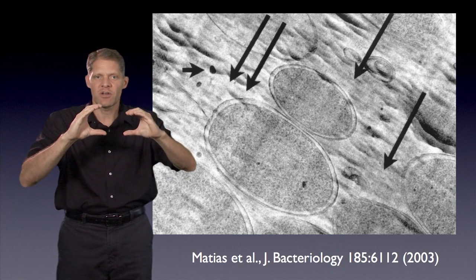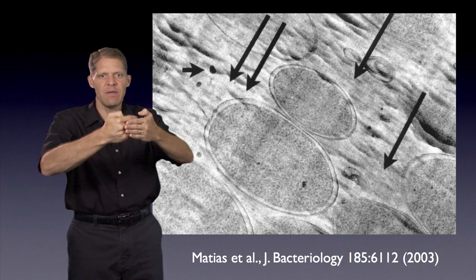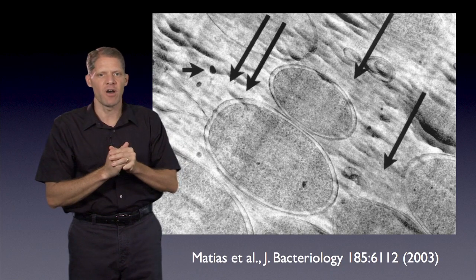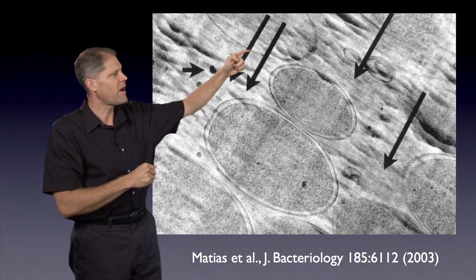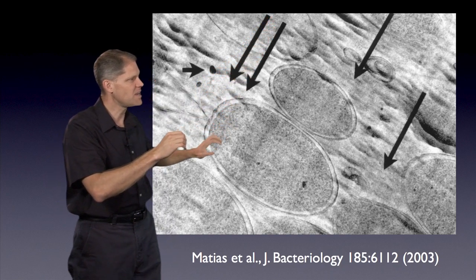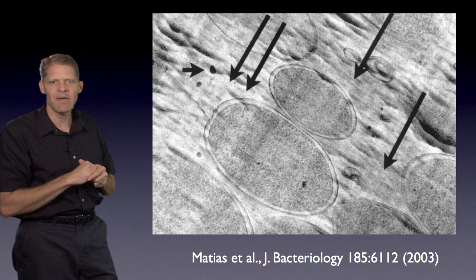In addition to being compressed, as the high-pressure frozen material scrapes across the diamond knife, there are knife marks. The knife marks in these images are represented by the black arrows, where you see streaks streaking down across the image. Those are from imperfections in the diamond knife.